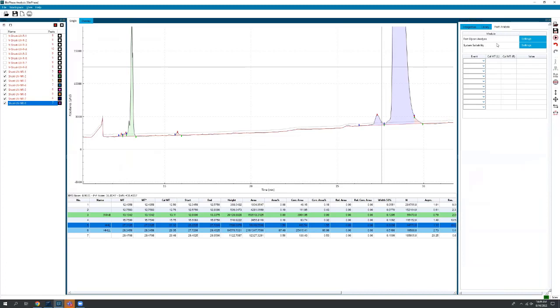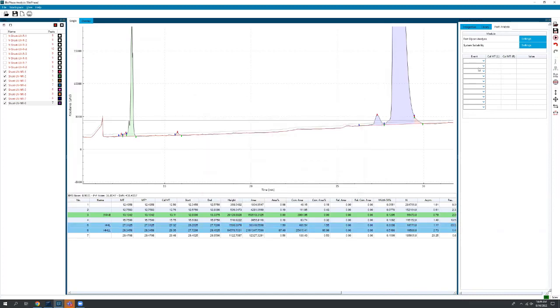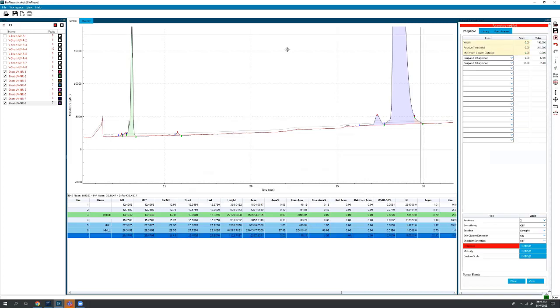And you can also do some things in the post-analysis. You can set system suitability parameters to show you which might have failed. If you're looking at, say, main peak, corrected area percent has a min value. So you might say this main peak has to have a minimum value of 95%, otherwise it's going to fail. You can do that. You can have it merge peaks. So if you always want this peak to merge, and you can't get the analysis parameters to do that, you can just say, I want you to merge the peaks from this migration time to this migration time. And the software can do that for you.